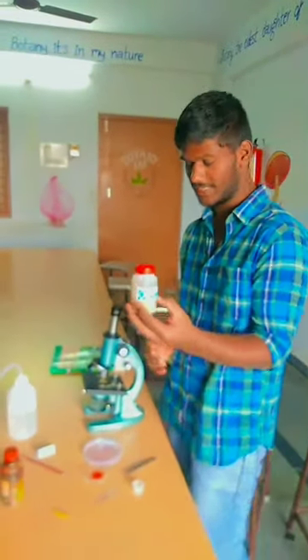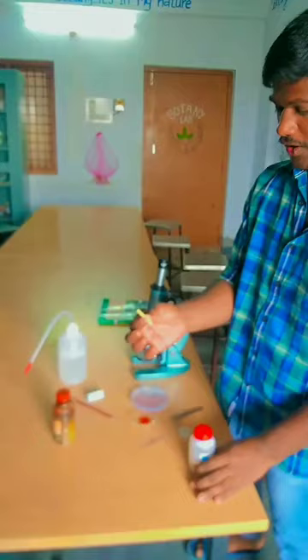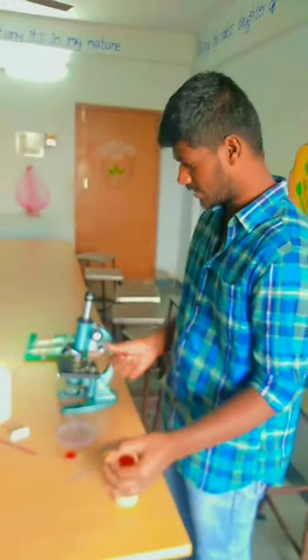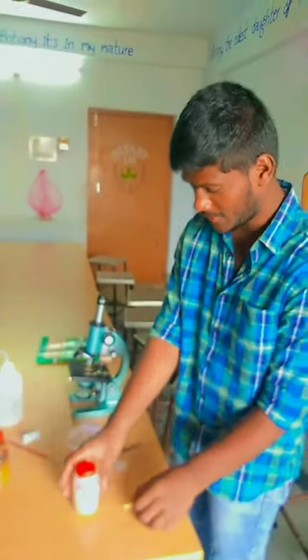This is a monocot stem bundle. This is a single monocot. These are the ingredients to do the monocot stem. We want to see it in the microscope.